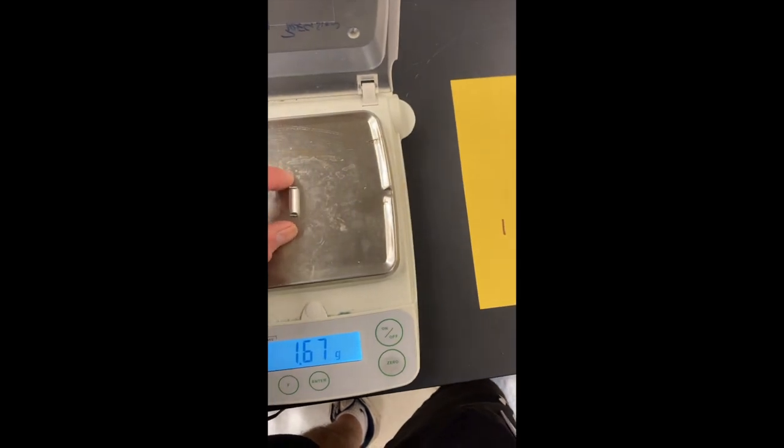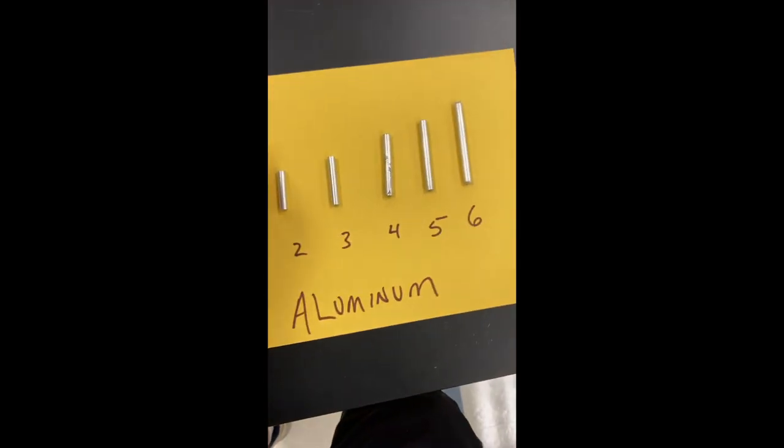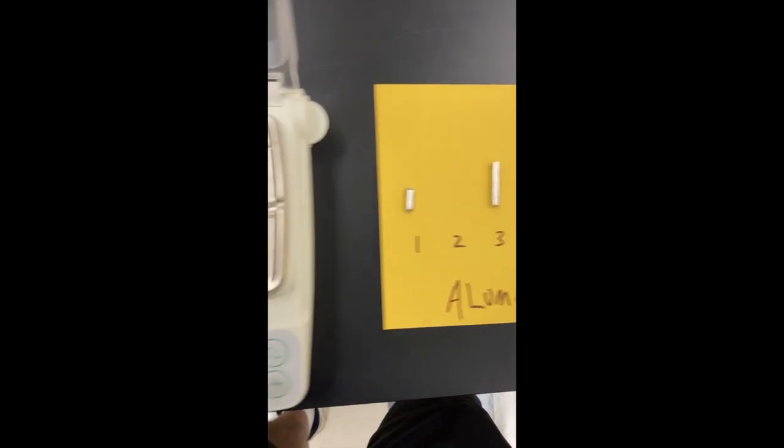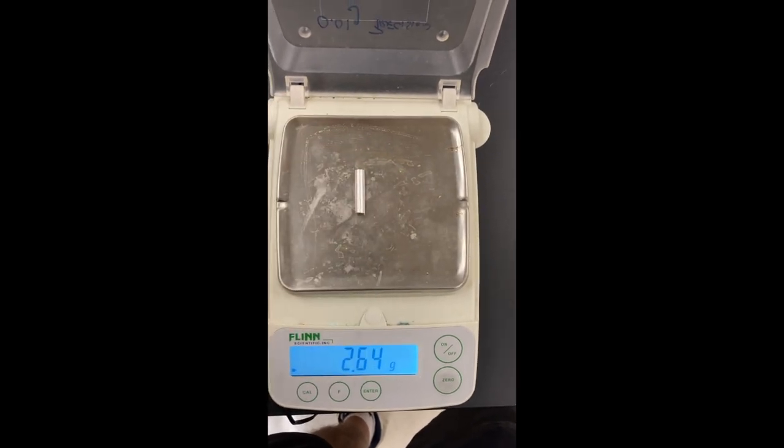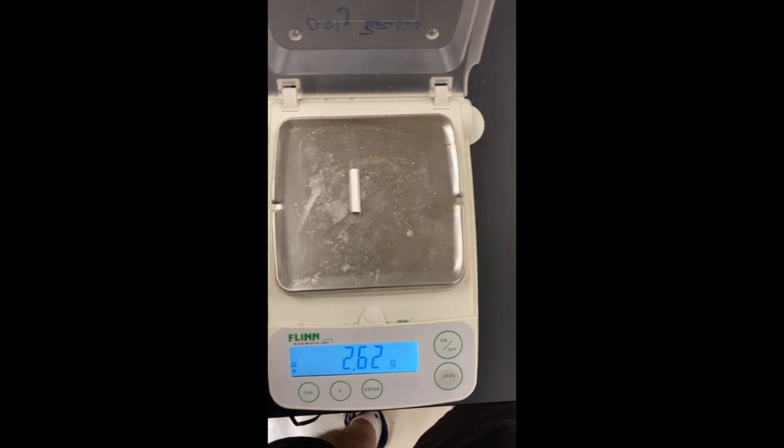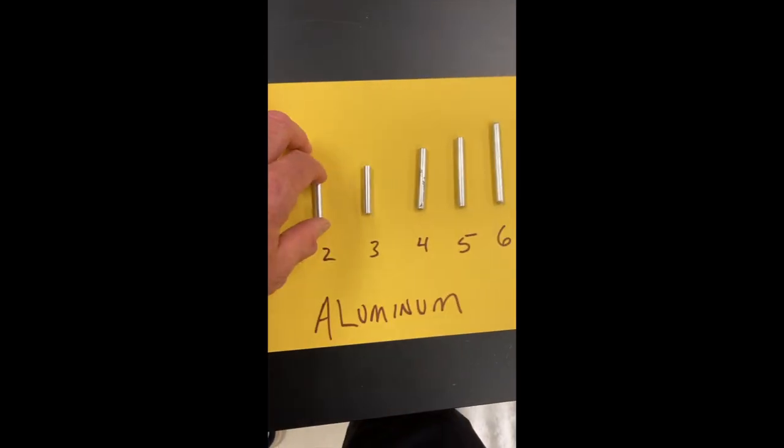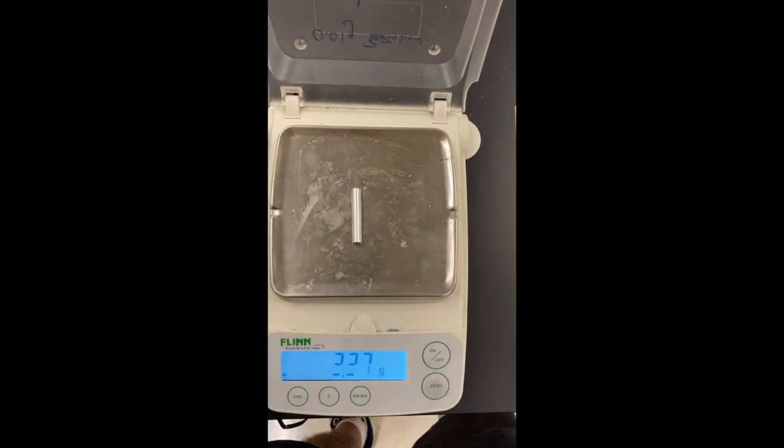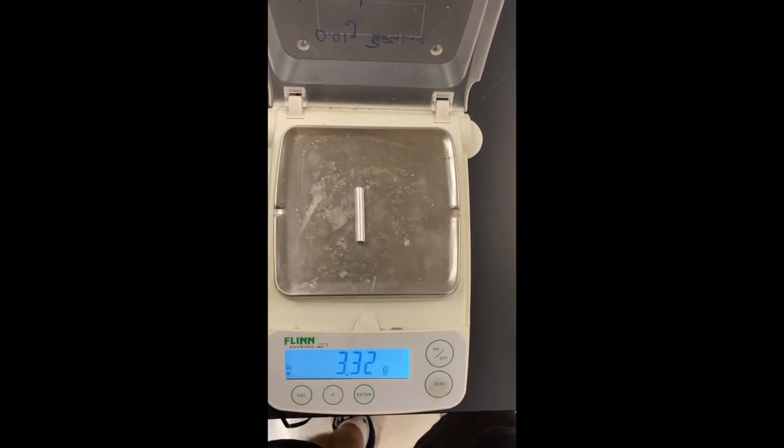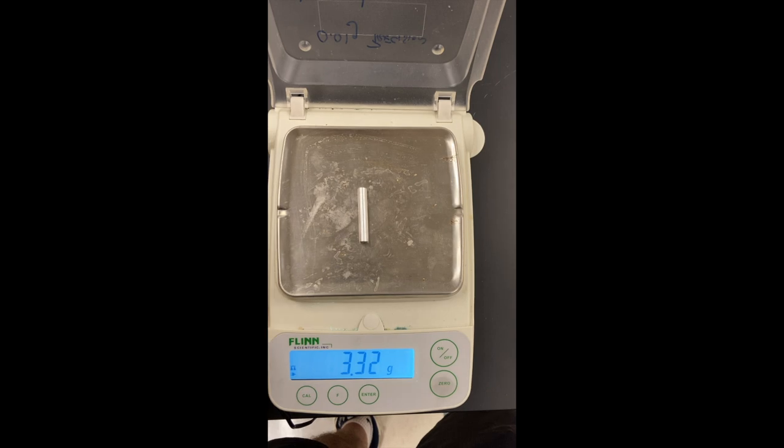Okay, let's get piece number two. Check our scale, it reads zero, and this is the mass of piece number two. Come get piece three. Piece three has a mass of this - write that down in your data table.